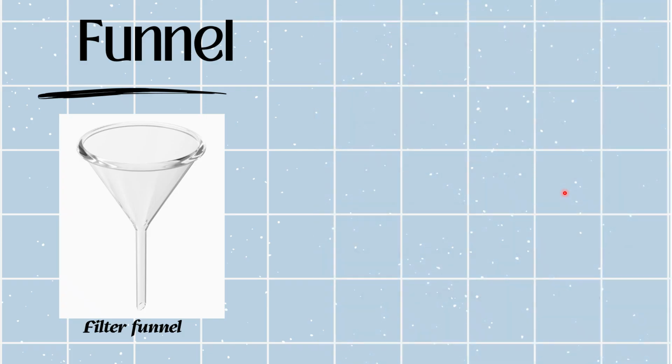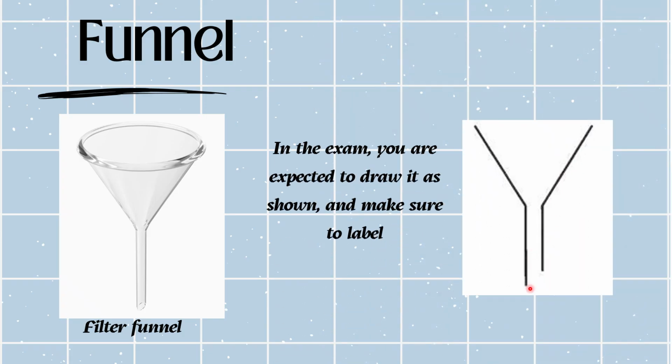Now in the exam, you're going to draw it in this way. Always make sure to draw this line a little bit longer than this line. As I told you, it will help us take each and every single drop of the liquid that we are going to filter out of it.